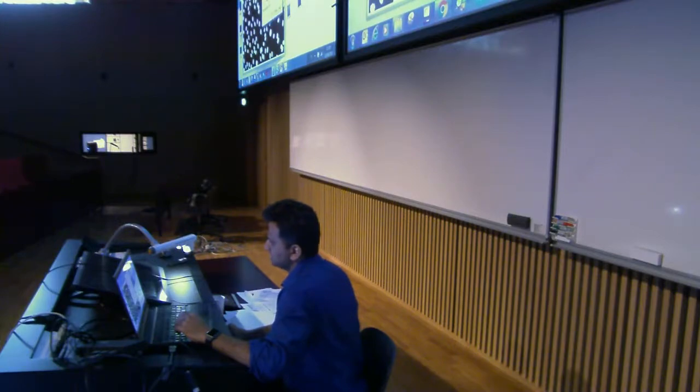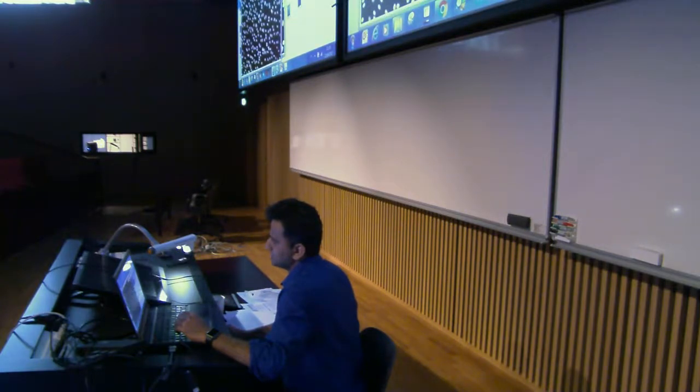Now it is not open, so I will just close this. I will open that first. Now go back, analyze, set measurements, and what is the name of that? That's the nuclei1.tif. Okay, because the name of the segmentation is different. It's nuclear.tif only, and the original raw data is nuclei1.tif. So I'm telling it to take it from there. So okay, and just go to analyze particles.